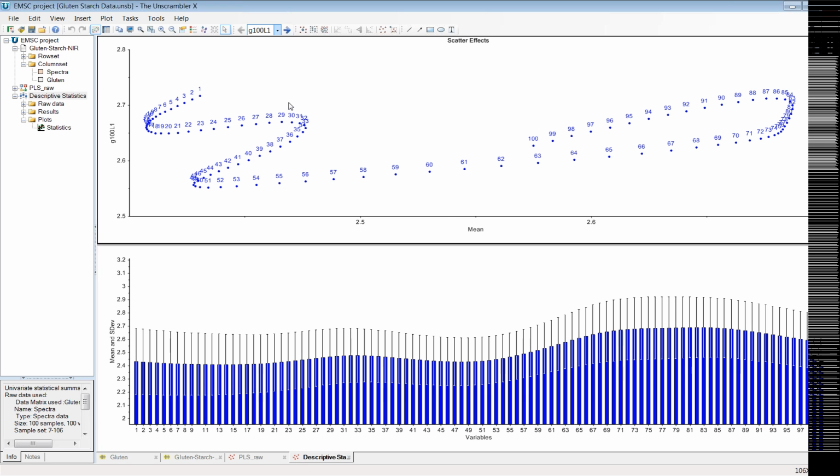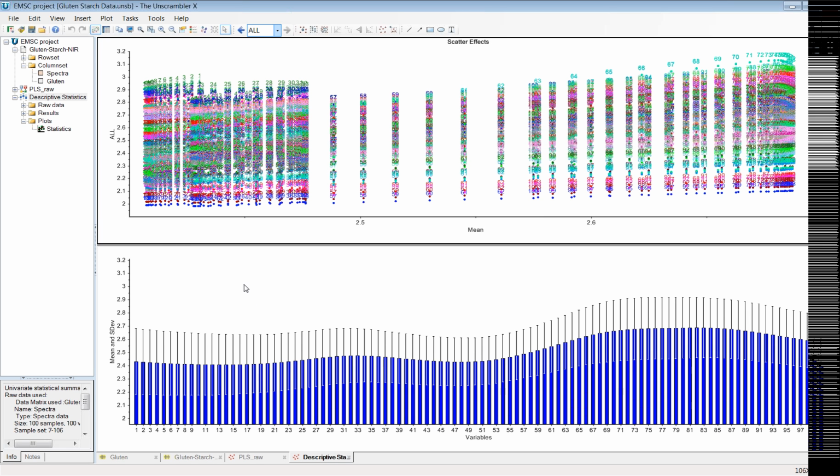This is just looking at one spectrum right now, but what I'm going to do is take a look at all of them together. Now, what we can see very clearly, I believe, is that they all seem to have a general similar slope, but there's just this offset in the y. So that tells me I want to do an additive pre-processing treatment first. What I tend to do is I start with derivatives because what that does is highlight your peaks of interest, and it should separate them out a little bit.